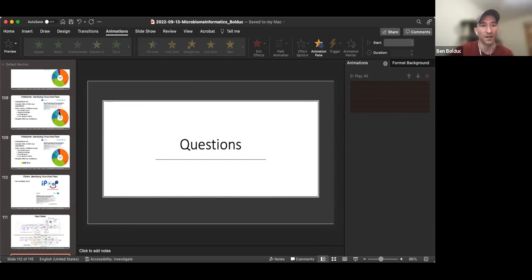And so I have used Diamond to help with viral identification, but in this case I think the bigger question is which databases you're going to use Diamond against. If you have a database of hallmark genes and you're looking for a particular viral type, you could use Diamond to search through that database of hallmark genes and help identify your viruses.